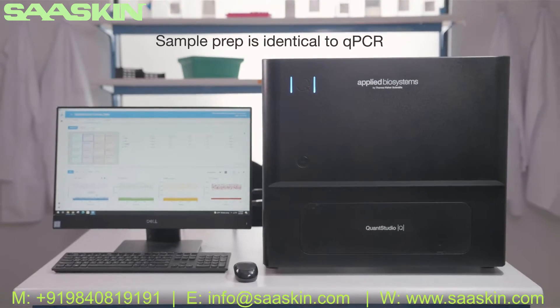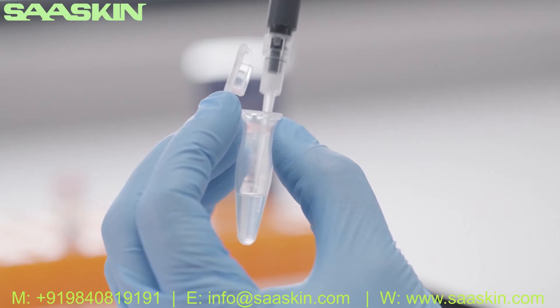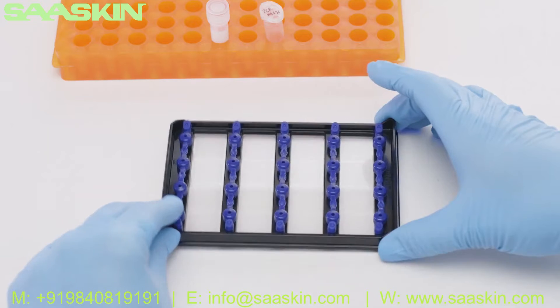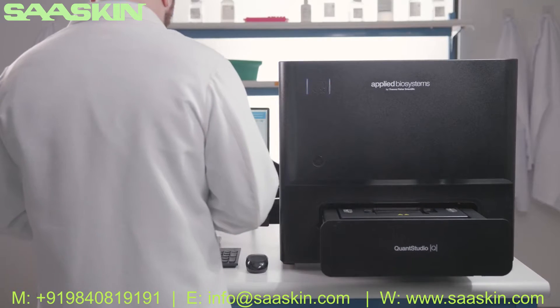Sample prep is identical to qPCR. Simply load your reaction into the plate and insert the plate into the instrument. All components of digital PCR, including reagent compartmentalization, thermal cycling, and data collection, are performed on the single standalone instrument.